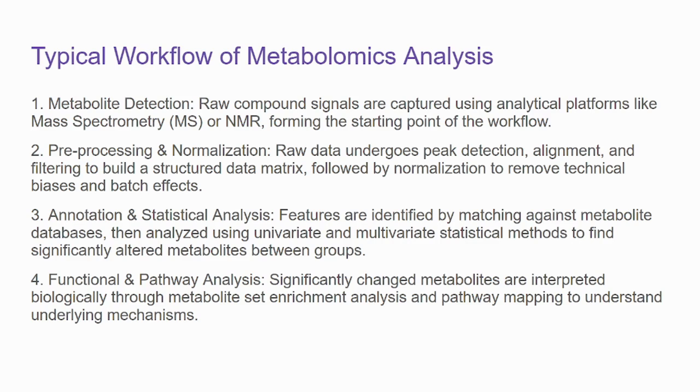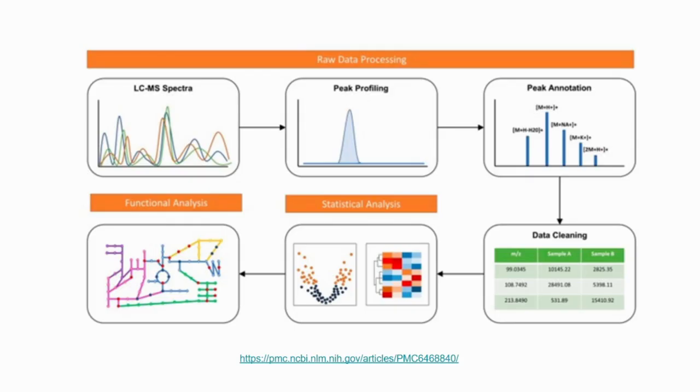Depending on the softwares we are using, it will be altered a little bit, but this is the overall typical workflow of a metabolomics analysis. So here is a diagram of how it works.